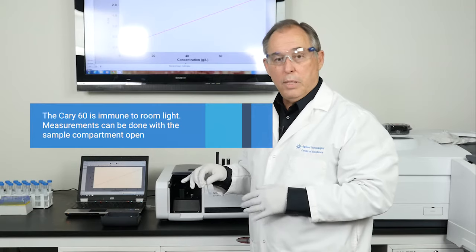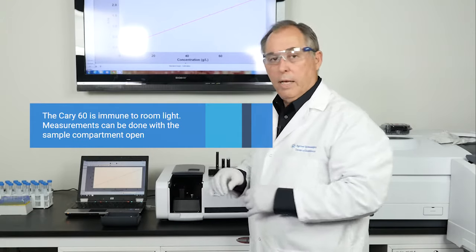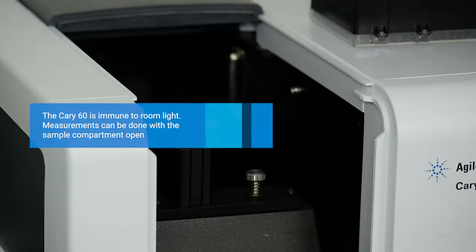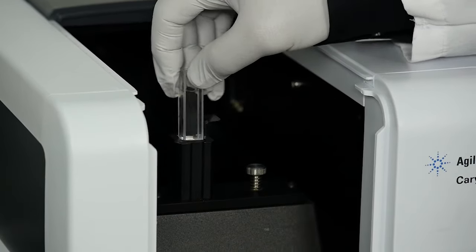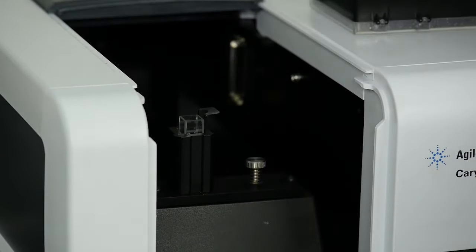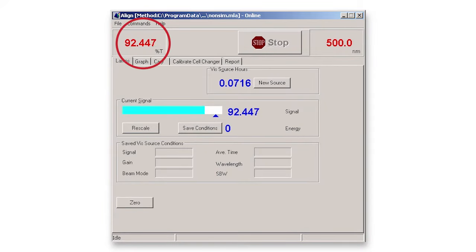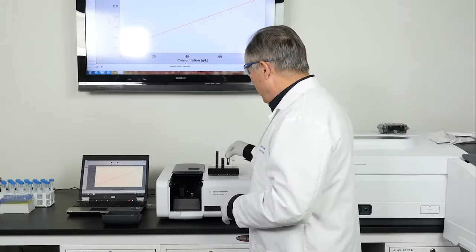And that allows us to do enzyme kinetics reactions, quantitative analysis with a sample compartment open. So I will insert the cuvette now and we'll take a measurement and see the energy.